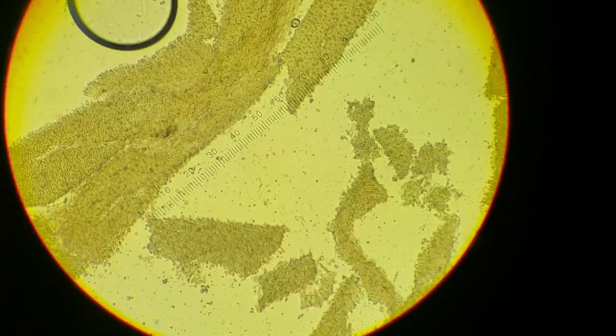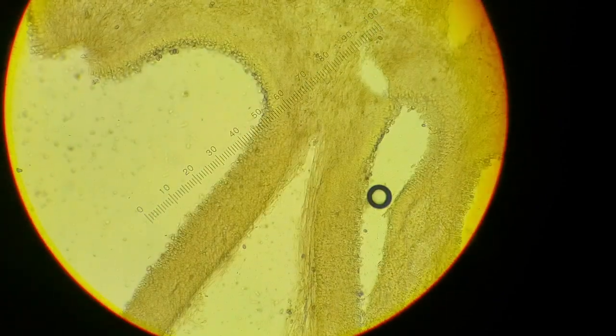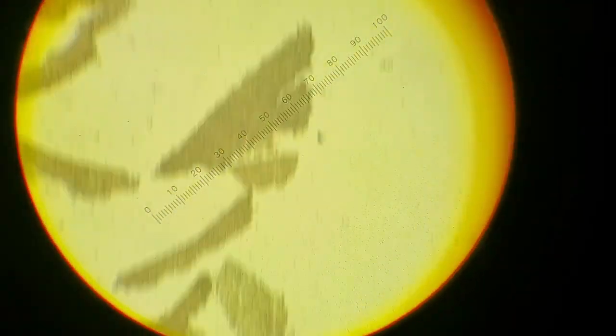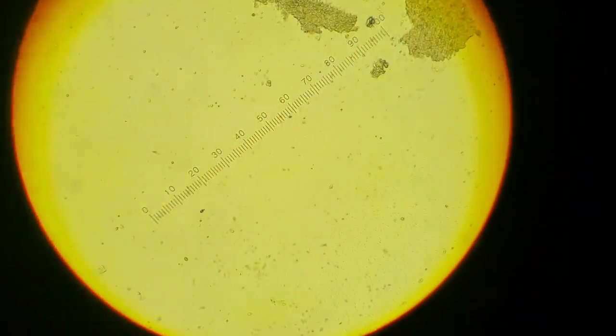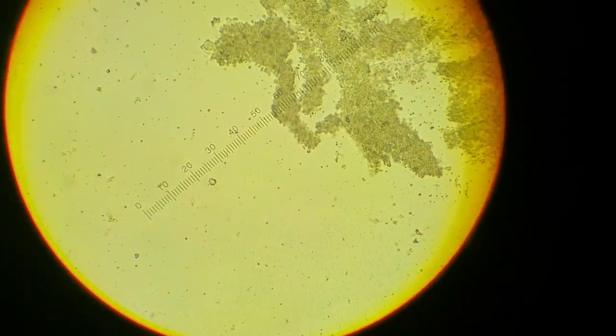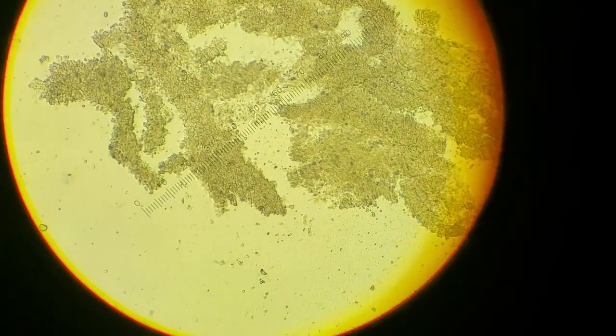And what we're trying to do is actually see the structures as if they were wide open and split apart from each other. So obviously this did not have enough squashing. I could have squashed a little bit longer. But in any case, there are some areas where you can tell already are going to be useful to look at. Let me just see if it's down here.